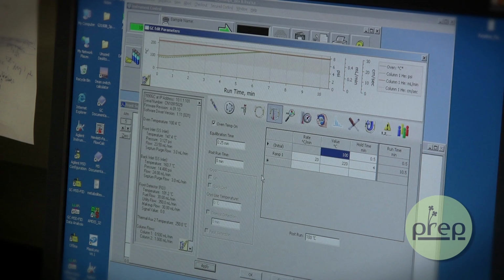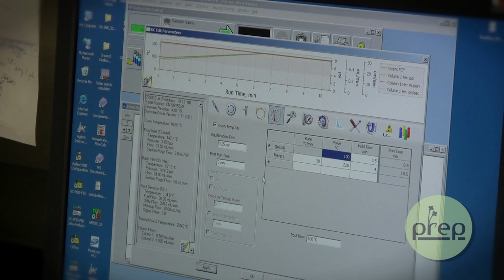So after you're done with your treatments, what I want you guys to do is collect some seeds for me so I can analyze them on this machine to find out how your treatments affected oil levels in the mutant versus wild type. And then we will share the data, and hopefully together we can discover how these treatments affected seed composition and contribute to scientific knowledge together.